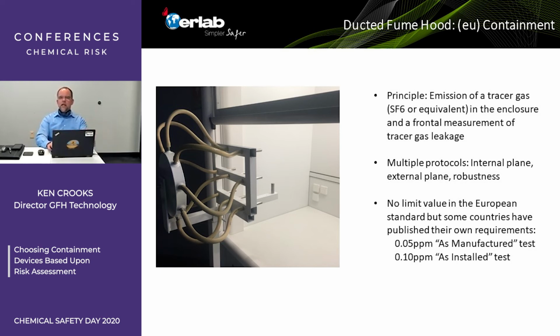So it must contain at the highest standard, and that is 0.05 ppm detected outside the fume hood, right? So otherwise everything else is contained. Once that fume hood is installed in the actual installation, in the laboratory, in the new building or the renovated building, you're no longer in absolutely ideal conditions.